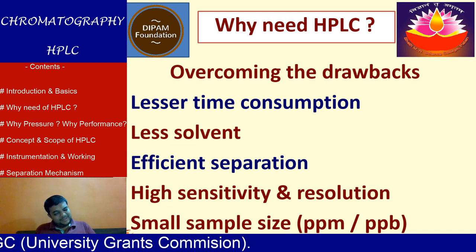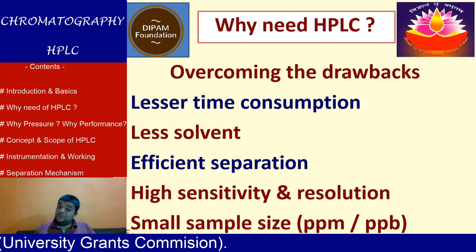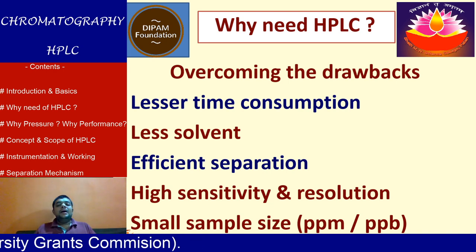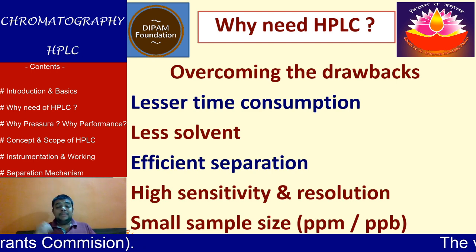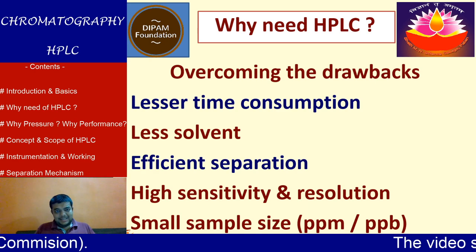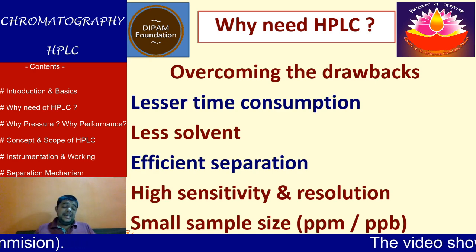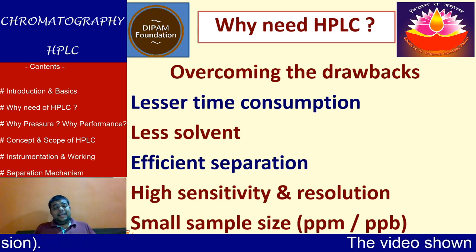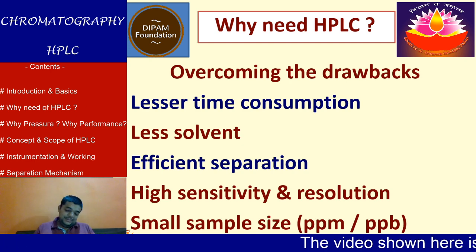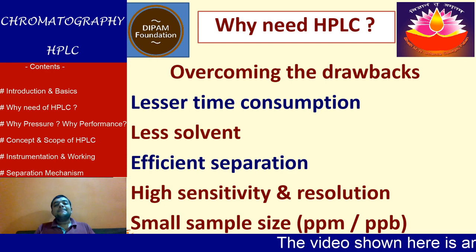Lesser time consumption, less use of solvent, efficient separation, high sensitivity and resolution, and small sample size. If you could get all these things done, then industry and the scientific fraternity, wasting an ample amount of time and money on research and serving society's needs, need this.